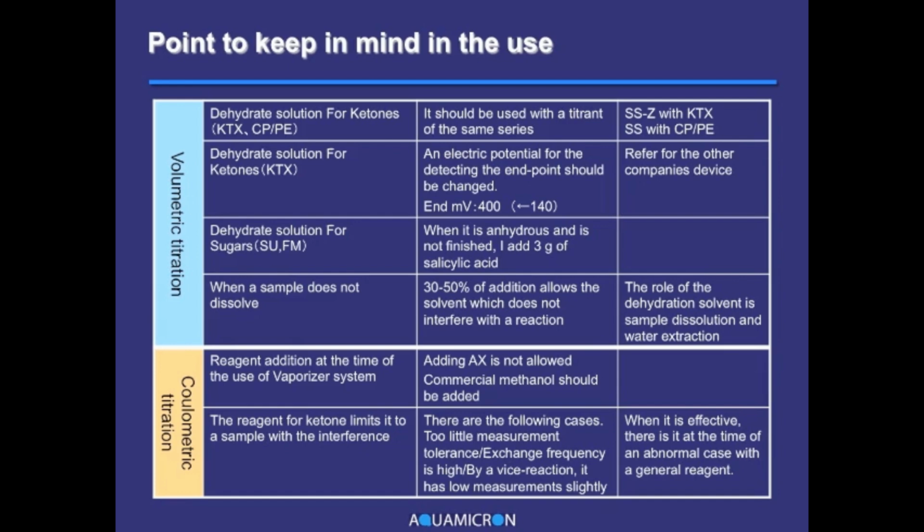You might think that salicylic acid could be added beforehand, but this does not work since it reacts with methanol and forms esters and water. Thus, you can add salicylic acid only when the dehydration does not seem complete.